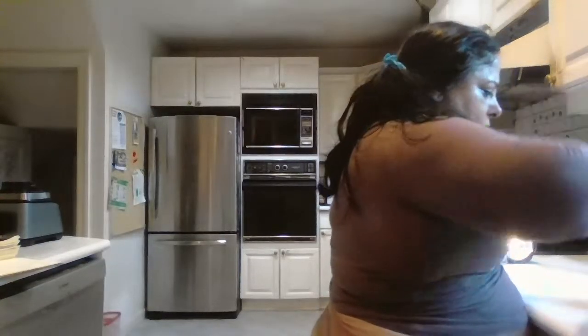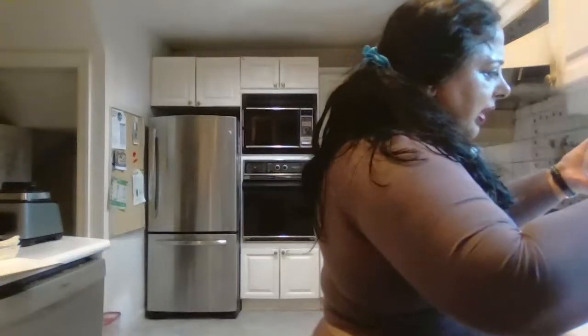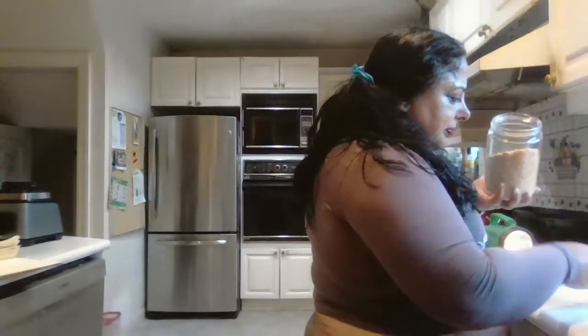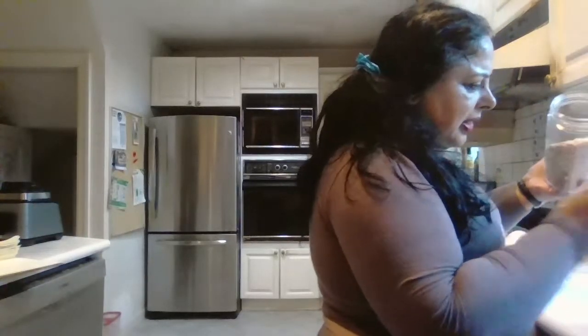This I know. So 40, maybe, for ease, an easy multiple of 25 for one. 40, I'll add copper. I never added copper. Copper is important for the biuret test. For the oats it's okay. Well, the oats I should have added.